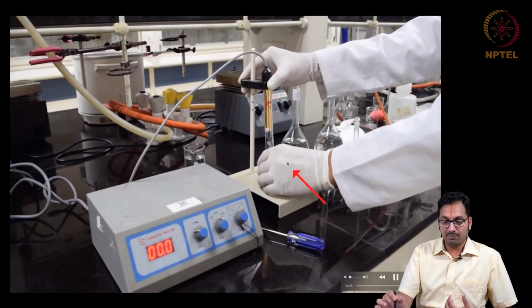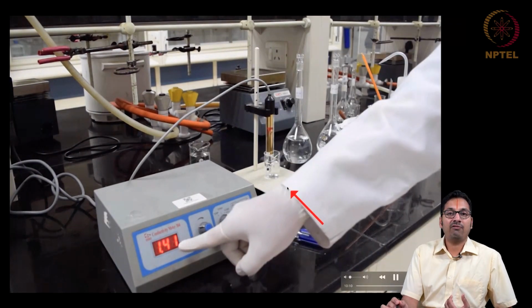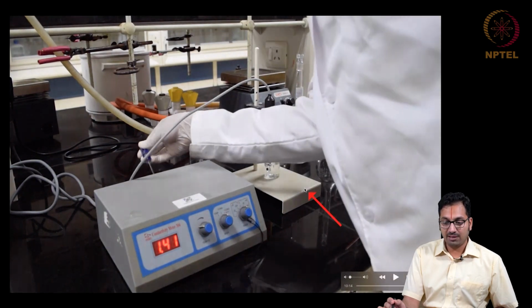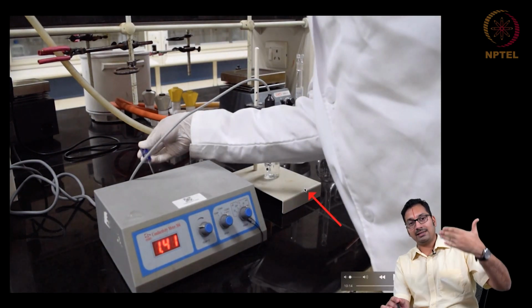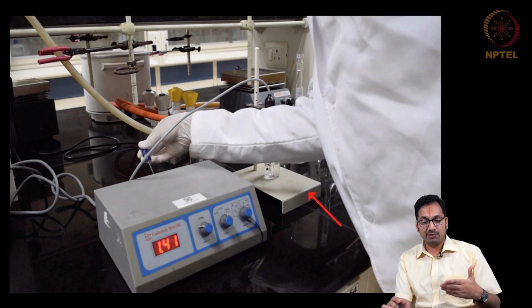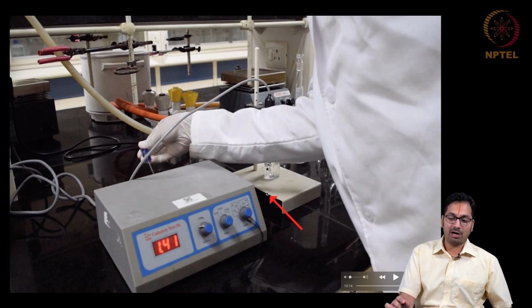Then you calibrate the probe and the conductometer with the standard solution of 0.01 molar KCl. You generally have a sheet that tells what the conductivity of the standard solution should be at that given temperature, and at the back of this conductometer you would be able to adjust this value.